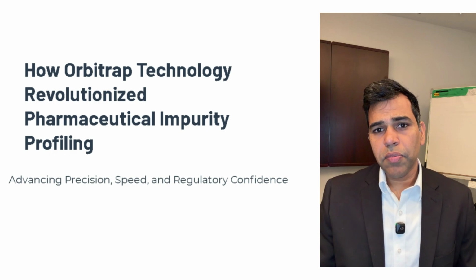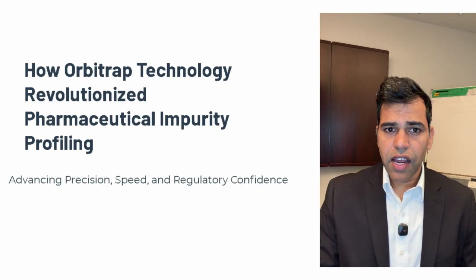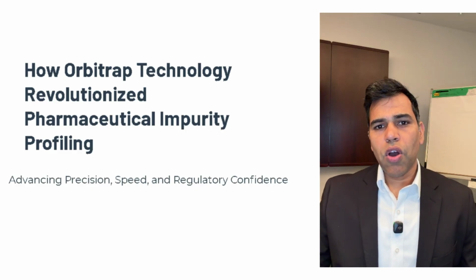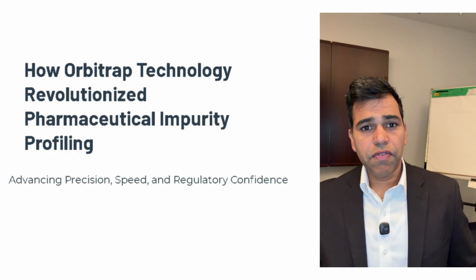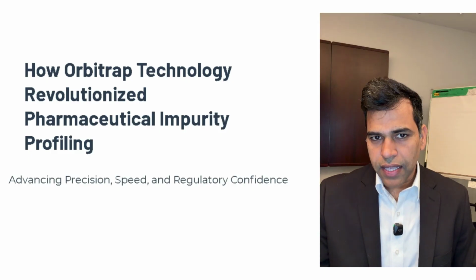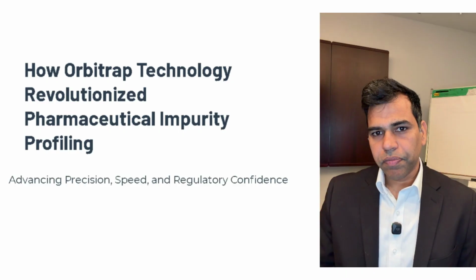Hi, I'm Raghuveer Singh Parmar, a pharmaceutical analytical scientist director at Revolutionized Laboratories, and today I want to talk about the technology that fundamentally changed how we approach that problem, and that is Orbitrap high resolution mass spectrometry.